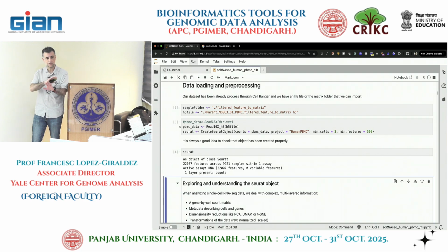Remember I told you I have assays on top. The object that I showed you earlier has metadata and count tables and all that, with 2 types of duplicated data to some extent. Currently it only contains what we call one assay, which is the RNA one here. When we transform the data, we're going to have two assays, the RNA and the transformed assay.